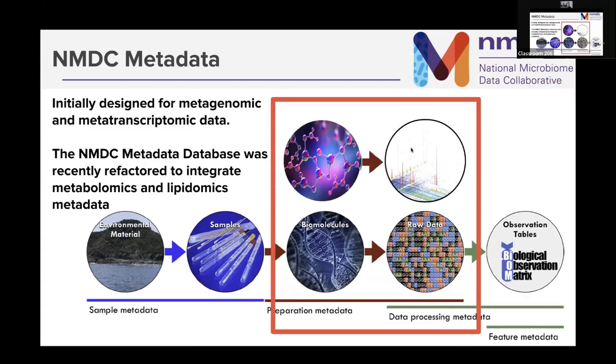And so initially this metadata schema was designed by and for biologists, and specifically folks with a lot of experience in metagenomics and metatranscriptomics. Once folks like me, who have more of a background in metabolomics and proteomics, the mass spectrometry side of things, realized that this step of what we're calling data generation, going from a sample in a lab to a file on a computer, either sequencing or mass spectrometry, which Lindsay really nicely laid out, this modeling had to be expanded in order to make this aspect of the metadata conform with standards and to make our metadata FAIR in this regard.